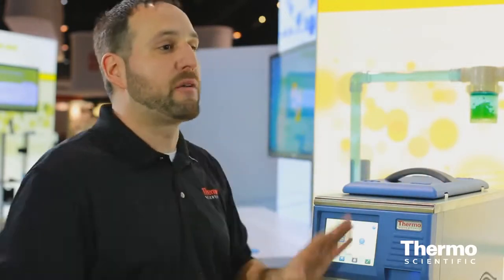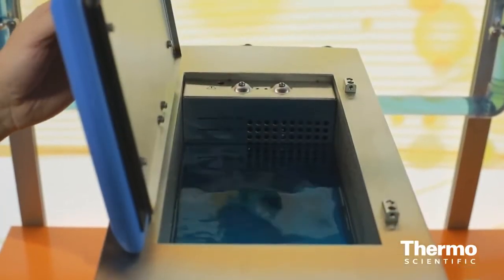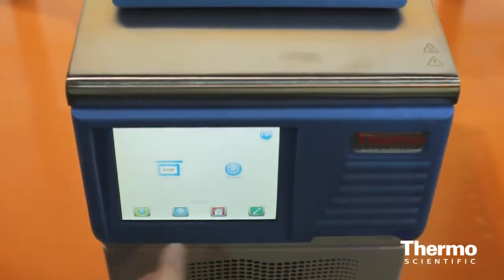Traditionally, bath circulators have a control head and coils in the bath. We got rid of it. Took everything out, put it in the unit in the front, inside the unit itself.